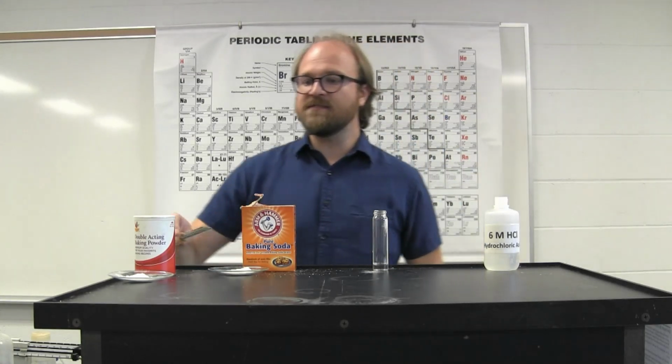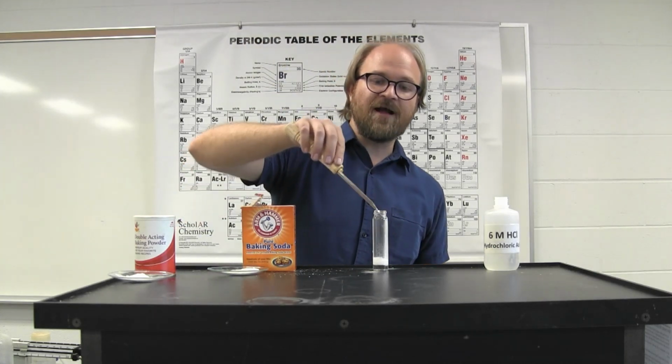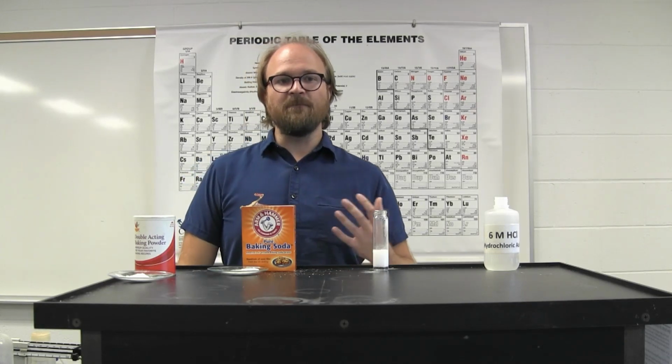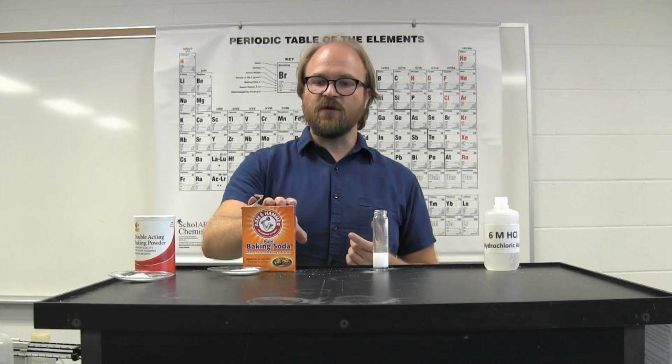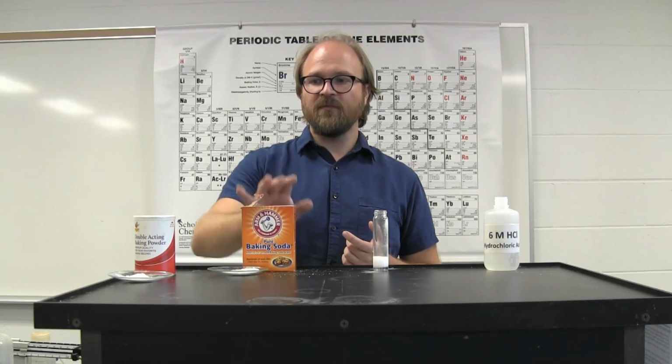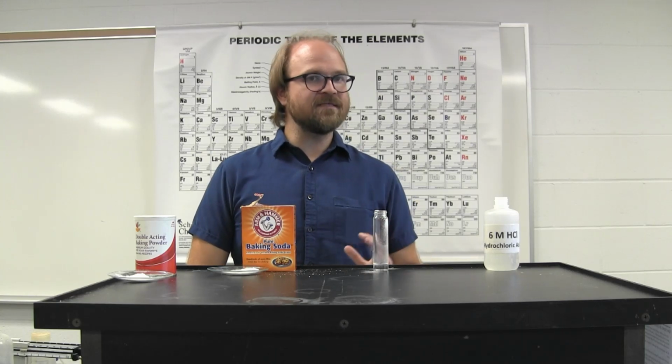You're looking at the masses before and after the reaction to figure out the mass of carbon dioxide, leading to the mass of carbonate, and determining the percent carbonate of sodium bicarbonate, the percent sodium bicarbonate within baking soda, as well as the percent carbonate of an unknown compound, and comparing that to the list of possible carbonates to identify what your unknown carbonate is.